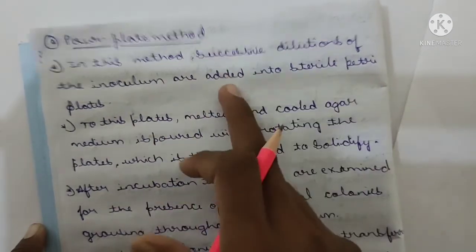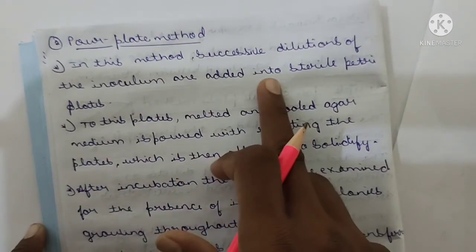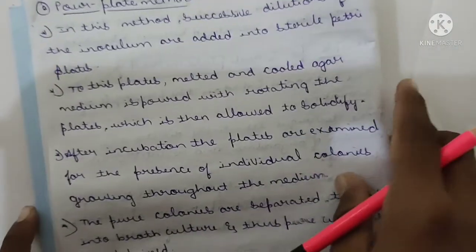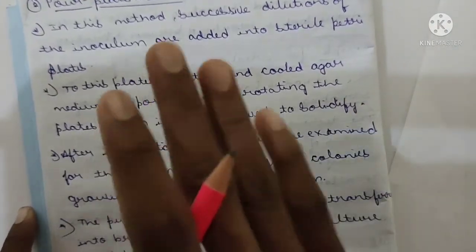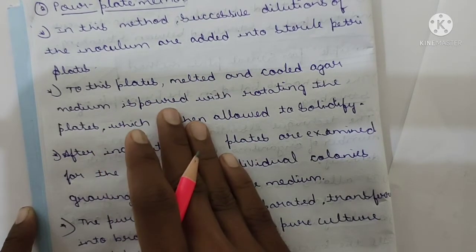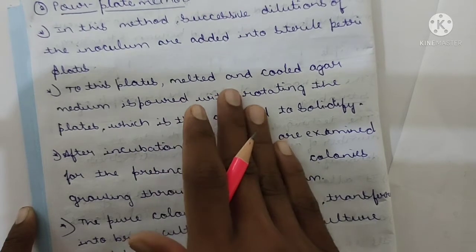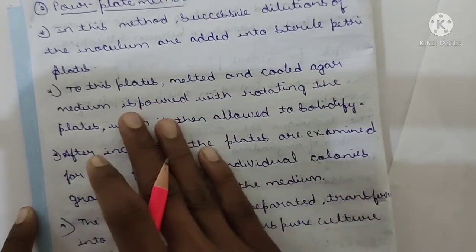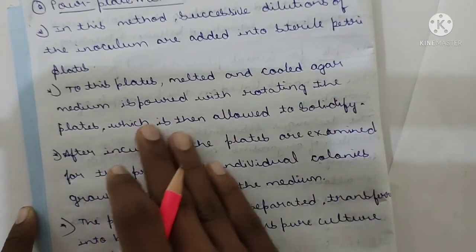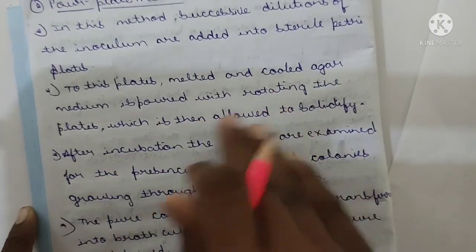I will explain this point later, because you cannot understand it now. See here, to these sterile petri plates, melted and cooled agar medium is poured, with rotating the plates, which is then allowed to solidify.